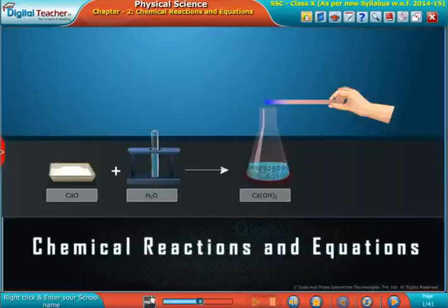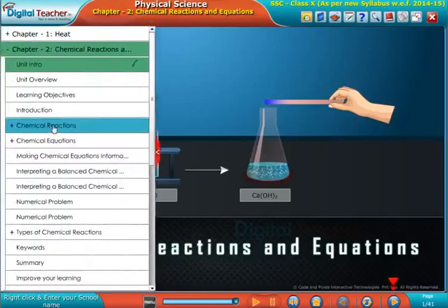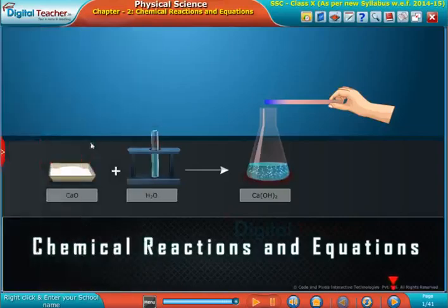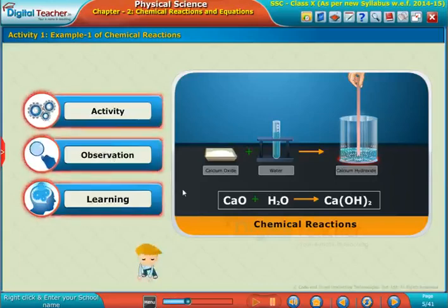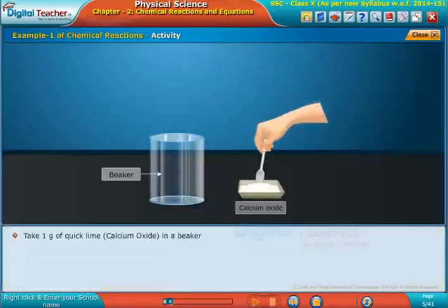Welcome to the chapter Chemical Reactions and Equations, Example 1 of Chemical Reactions. Click each tab to learn more. Take one gram of quicklime (calcium oxide) in a beaker.